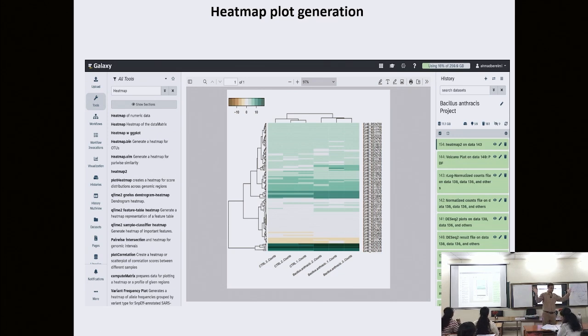Okay. So the gene network is just like a graph. Two genes that have similar expression will get connected, based on correlation of the gene expression. So if it is above a certain threshold, you will connect those genes.